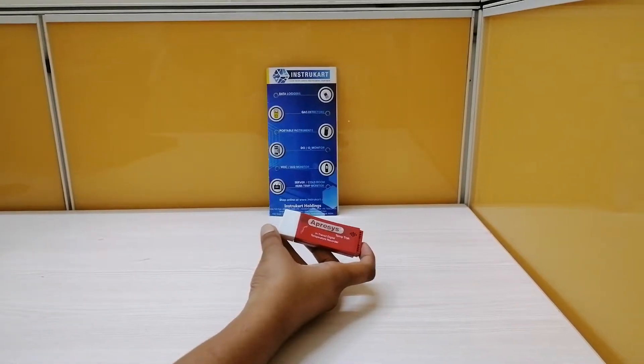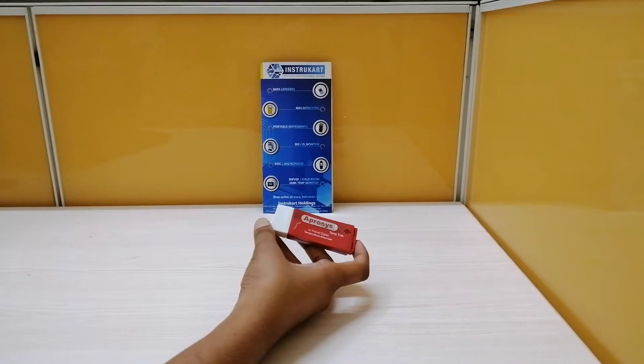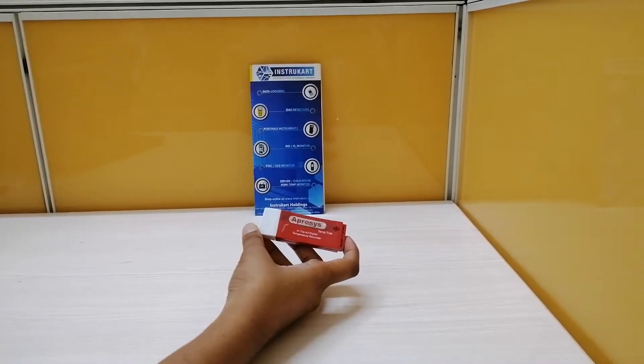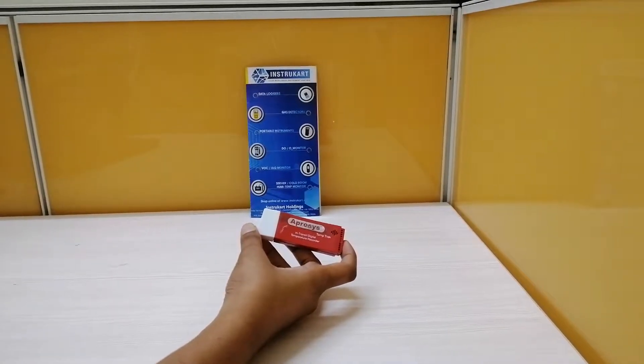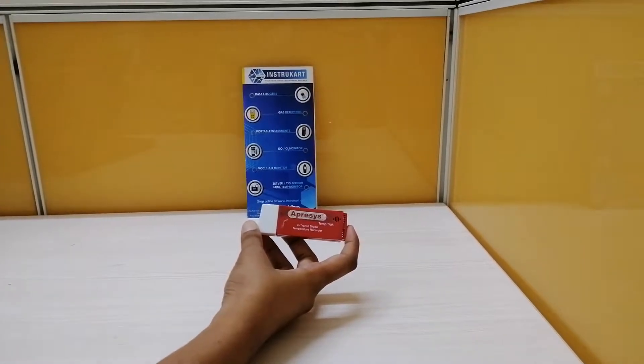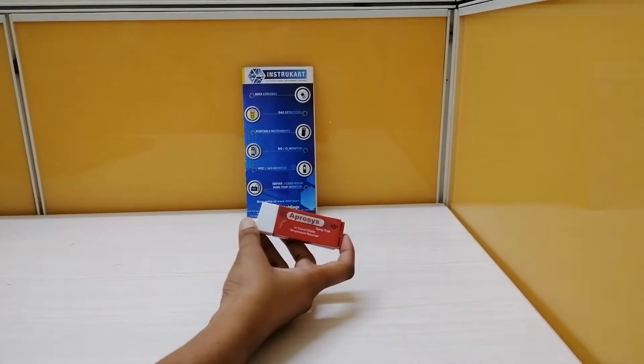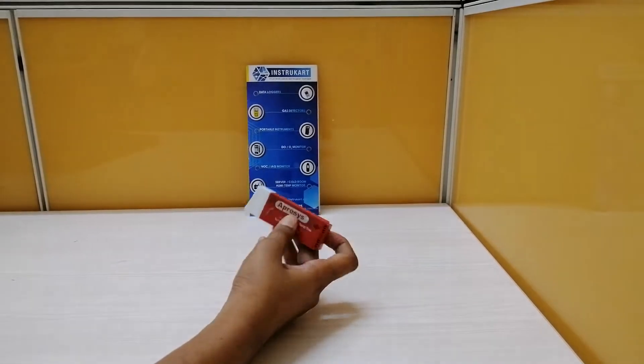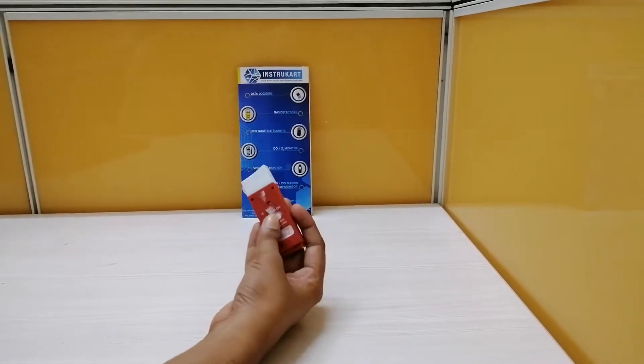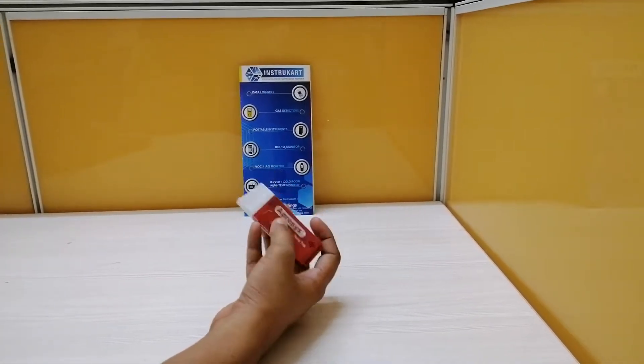If the maximum recording capacity is 25 days, the model is D25. If the recording is 50 days, it's D50. And if the recording capacity is 99 days, the model is D99. This is the 99-day capacity model, D99.